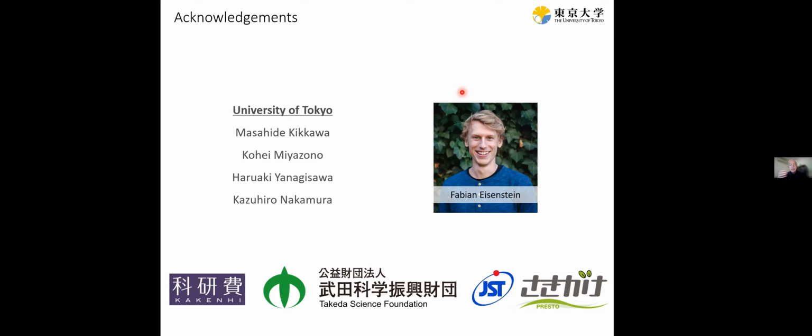Although there is a paper from UCSF, I think Dave Agard and Yifan Cheng's group, they published a paper showing that there is definitely an improvement in performance with CDS. Of course, it requires you cutting down the exposure rate in half, so you have to use maybe twice as long exposure time. So there is again a compromise. But in our workflow, it seems to work well. So yeah, I can't say for sure though. Don't bet on this.